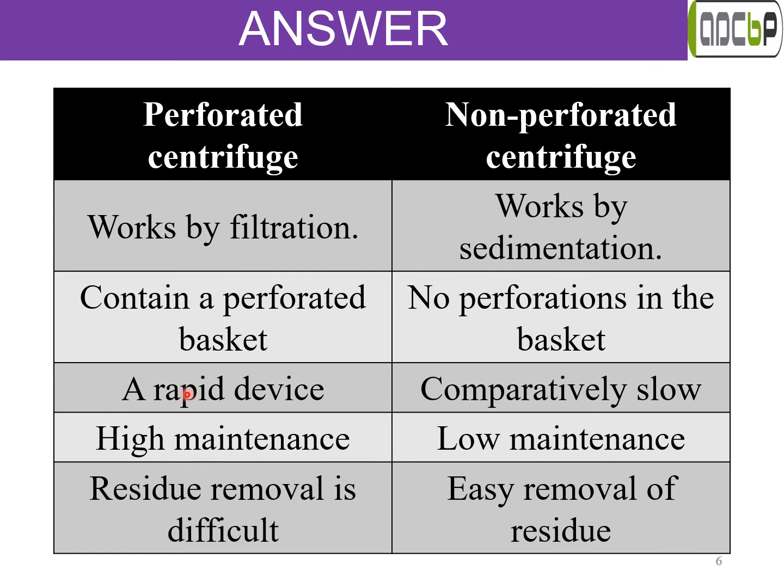As earlier discussed, the perforated centrifuge is a very rapid device, whereas non-perforated centrifuges are comparatively slow in their process. High maintenance is required for perforated centrifuges because of the wear and tear of the perforations, whereas low maintenance is required as there are no perforations in non-perforated centrifuges.